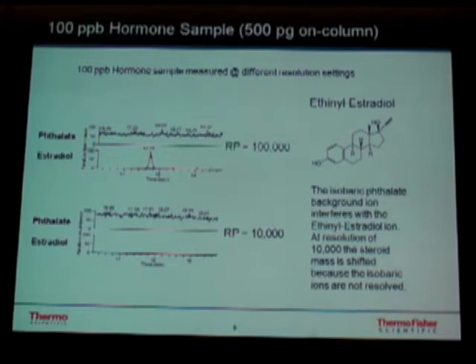Here is a comparison of 10,000 and 100,000. As you can see, in the same LC-MS run, if you extract this mass with less than 5 ppm mass accuracy, the peak comes out of the noise very clearly. That's what the high resolution exact mass really buys you. Right? So moving on.